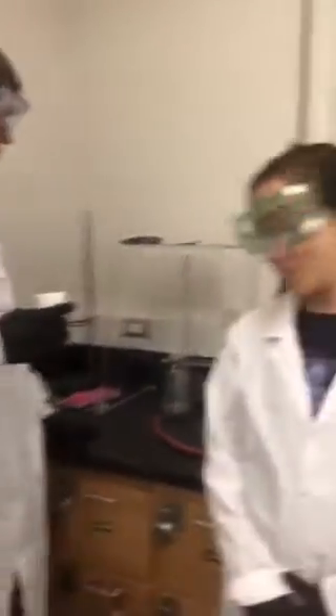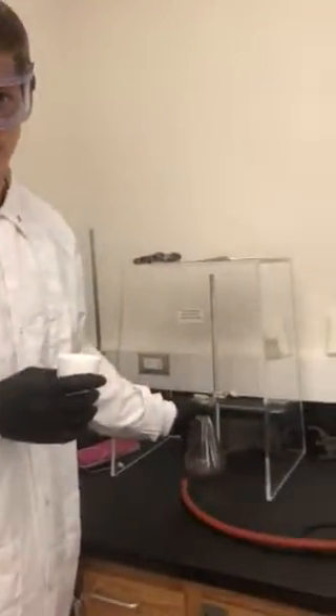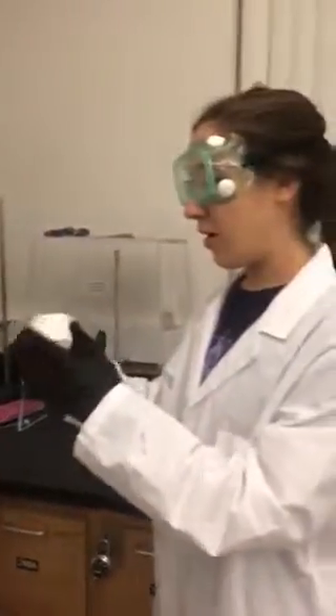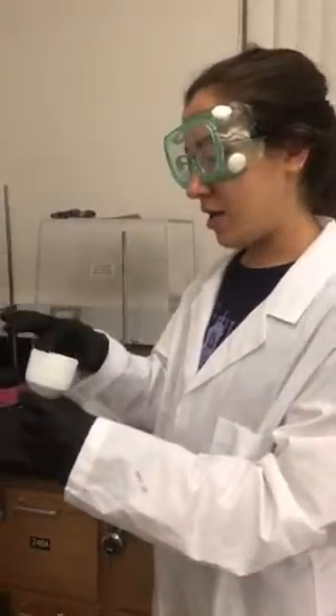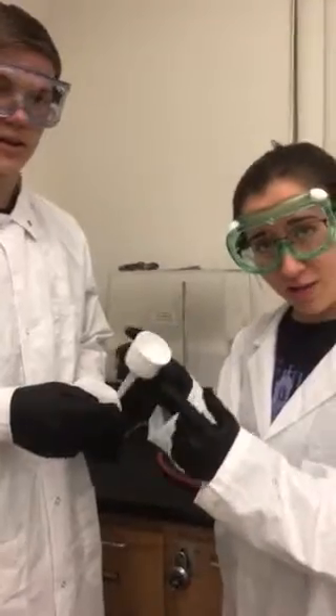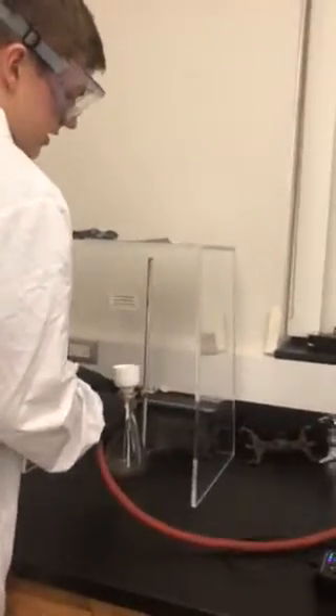Today we're doing vacuum filtration and we start by connecting it here by the neck of the flask to stabilize the whole shebang. Next we'll take our funnel and inside we put this on the filter adapter. Notice we have a filter inside. We already wet it with water so we won't do it again, and we stick this there. And then we attach the tube to the flask here, and then this end goes to the yellow vacuum.